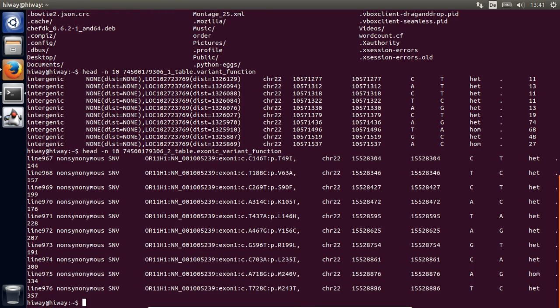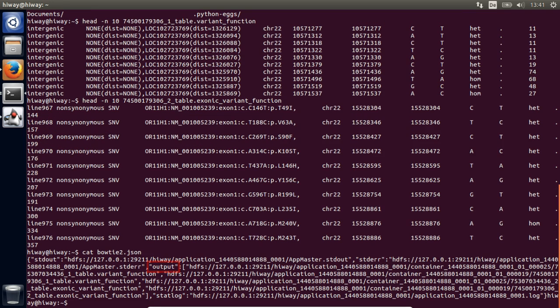Repeatability of experiments is of utmost importance in science. Accordingly, Highway provides a comprehensive provenance trace that logs events and statistics at different levels of granularity. Let us have a look at the summary file. Aside from a handle to the output of the workflow, the summary file gives us links to several log files created during workflow execution.